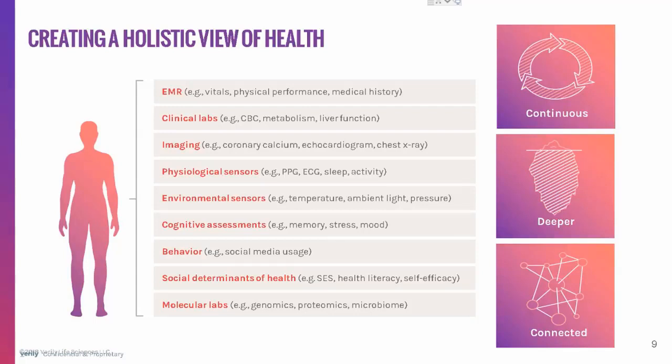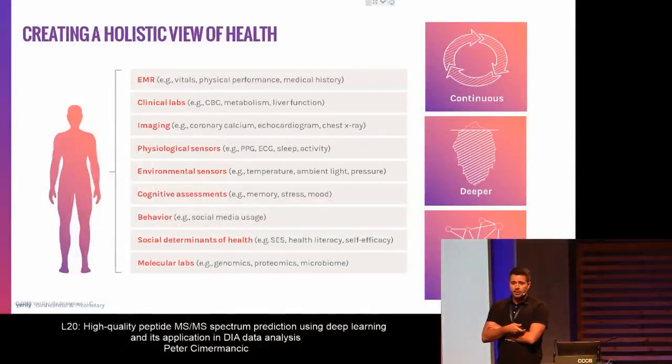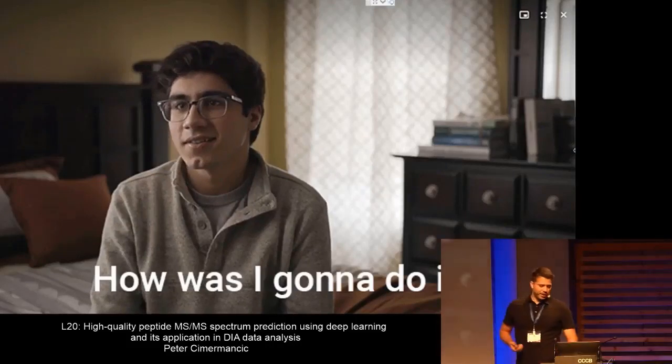And most importantly, we also go through molecular labs. So we just measure all the omics in different bodily fluids. And the omics includes metabolomics and proteomics, which is of interest here. But the goal of this study is not only to collect this data, it is also to analyze it with the best possible tools available. And in some cases, the tools are not sufficient, so we are going to develop our own tools or improve on the existing ones. And since we are part of Google/Alphabet, how do we do that? Machine learning.